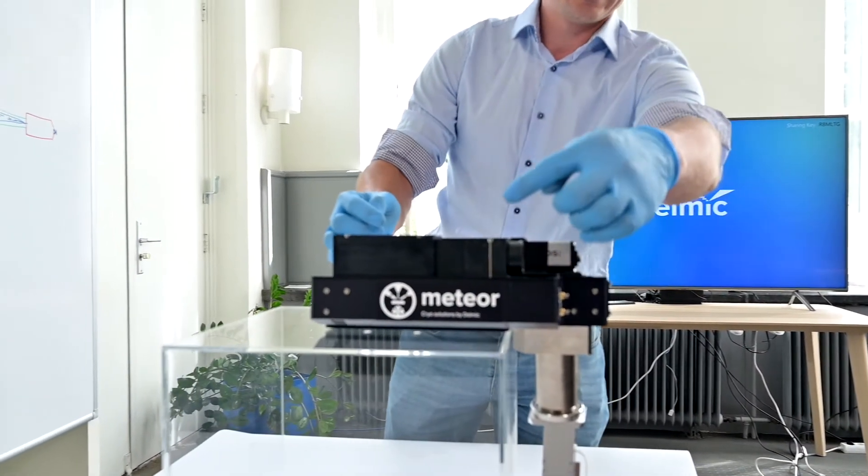Meteor is a very flexible system that can be integrated in a wide variety of workflows. I'll highlight a couple of steps.